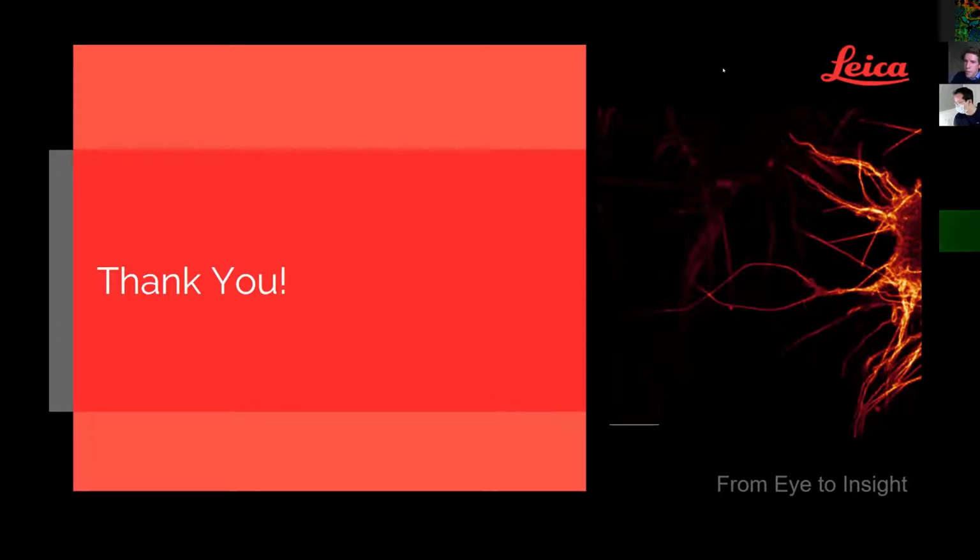She's asking that you say Tau-STED allows you to lower your laser powers. Is that the excitation lasers rather than the STED lasers? So thank you for the question. So you want to know if it's only the excitation part or also the depletion part, because of course for STED microscopy both add to the laser light that you put into your sample. And I totally agree. This is of course crucial if we talk about especially live cell STED or also large volume STED, that in total we lower the amount of light that you put into your sample.